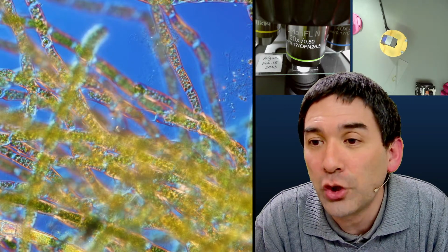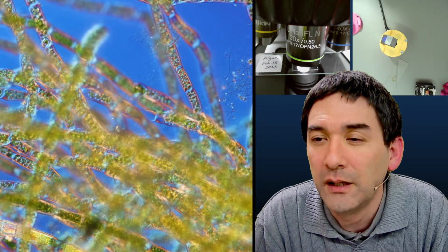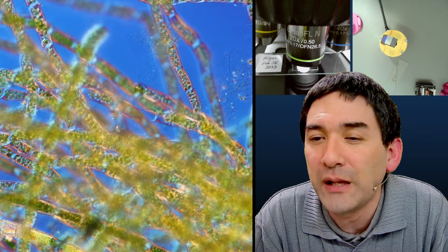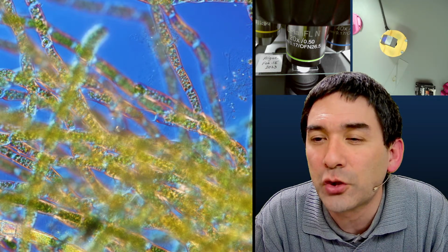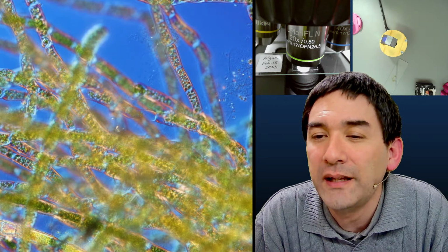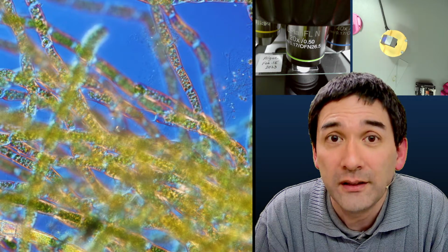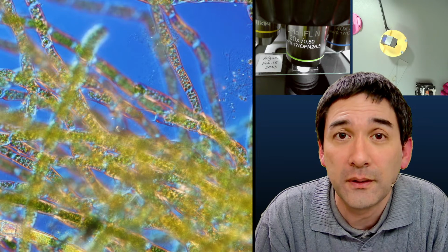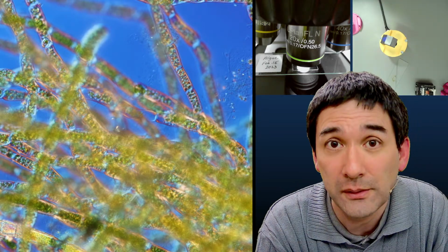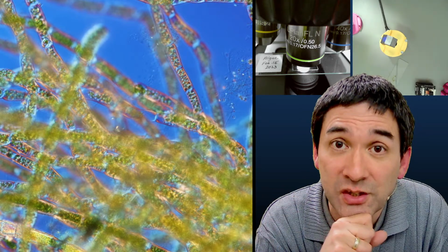Mycology is on there too, I suppose, on iNaturalist, so there are fungi. Something very interesting I found out today: people used photo scanners for negatives and positive films to scan microscope slides with bigger specimens. It goes to show how inventive people can be. Yes, that's also something that I've tried. You can also buy macro lenses and try to photograph slides this way.